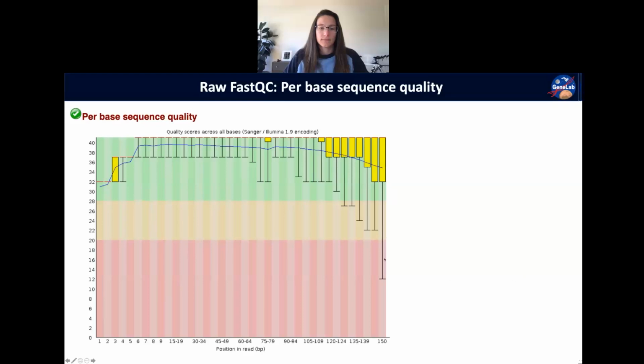And so I have a couple of questions based on this. Over here on the y-axis, that's our Q score. So that's our quality score. It's basically saying here that everything above a Q score of 20, which is 99% accuracy, they're considering good quality, and everything above 28, which is pretty close to 99.9% accuracy, is really good quality.